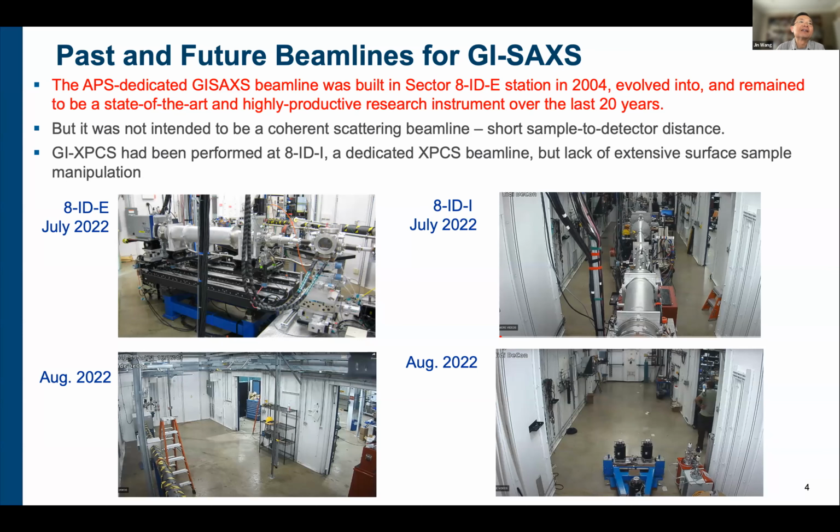But as we started from the beginning, this beamline was never designed for coherent scattering. Rather, 8IDI had been the dedicated XPCS beamline for coherent scattering.